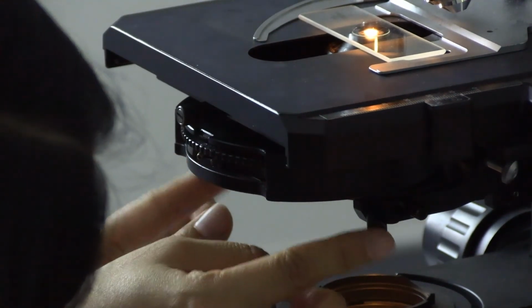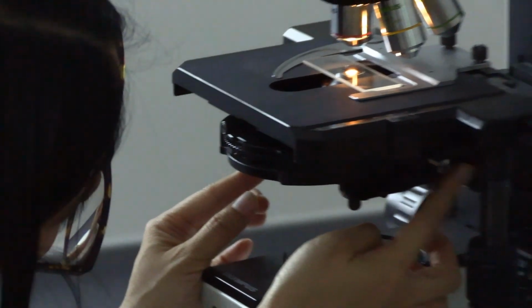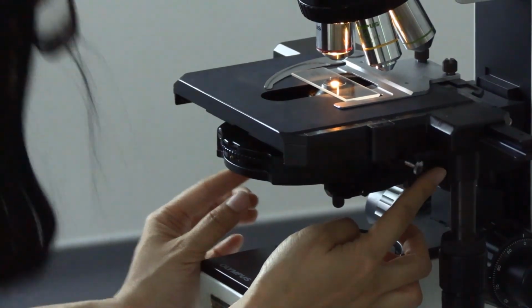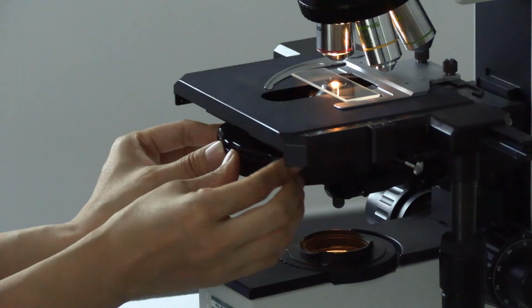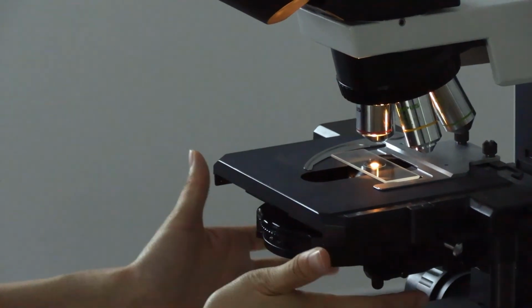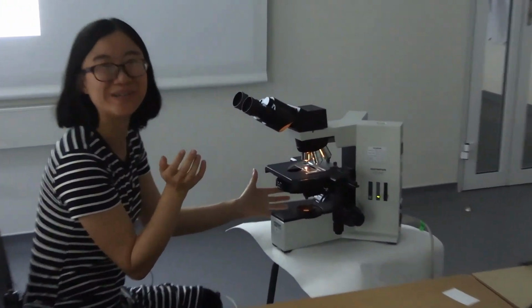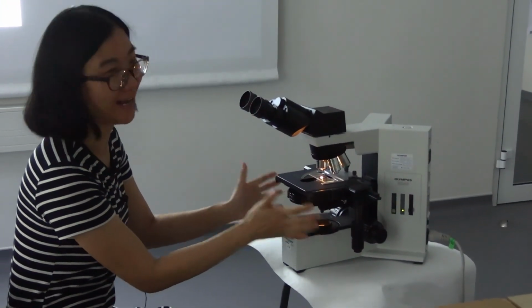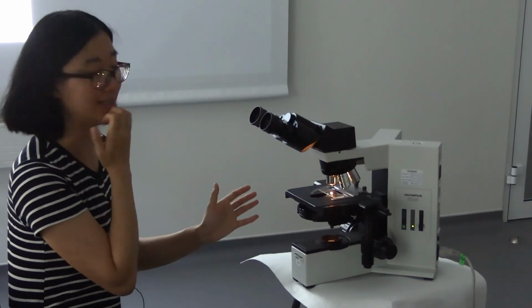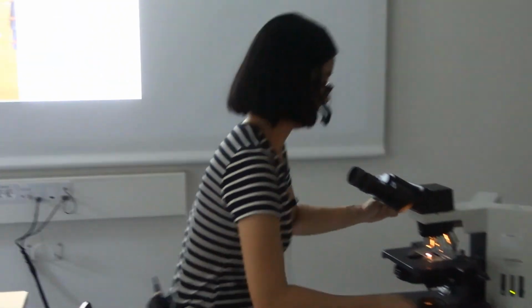And the two small ones here are these. Oh, I didn't show you here. Here, actually, are things that are linked to some plate. Don't touch anything here when you try to get the best image of your sample. So if you have any problem, ask one of the TAs or the teacher. Yeah, we will adjust it for you or help you to adjust it.